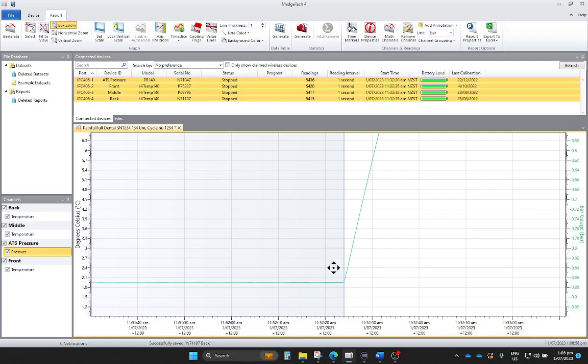Now that I've done this movement, our scale has changed. So you could actually lock the scale in, which can be a pain at times. So just remember the fit to view, and then the zooms will help you. Okay, we come back to our time slice.